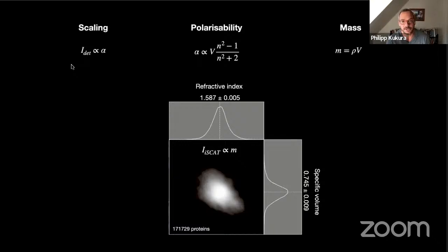Now, your optical properties will depend on the material to some degree, right? And how the electrons are localized in your material. And proteins are all made of the same amino acids, right? And the electrons in amino acids are all localized to the amino acids. So you wouldn't expect the optical properties to really vary a lot from protein to protein. So this part of your polarizability term is going to be pretty much the same, whatever protein you look at.